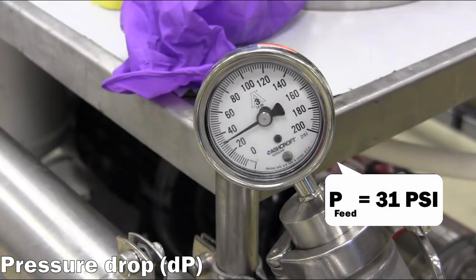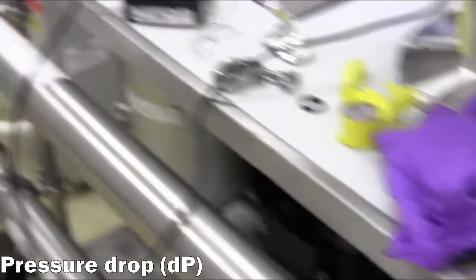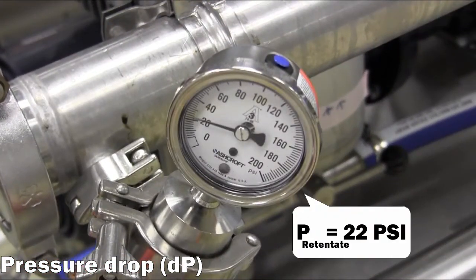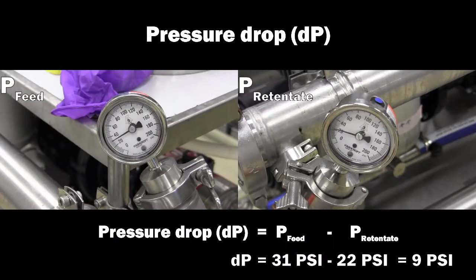In this example, the inlet pressure is read at 31 psi gauge and the retentate outlet pressure is read at 22 psi gauge, for a total pressure drop of 9 psi.